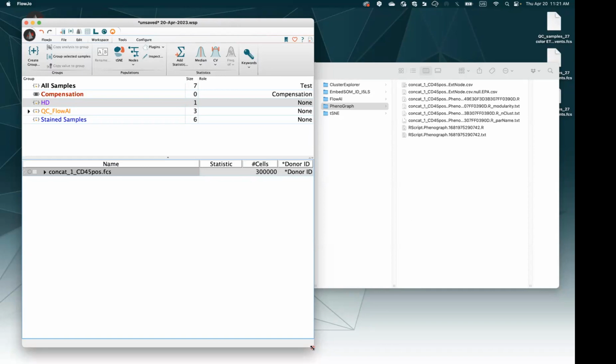If you decrease this number, then you will have fewer neighbors included, meaning we will study fewer cells in a specific region, and that will give you as an output more clusters.